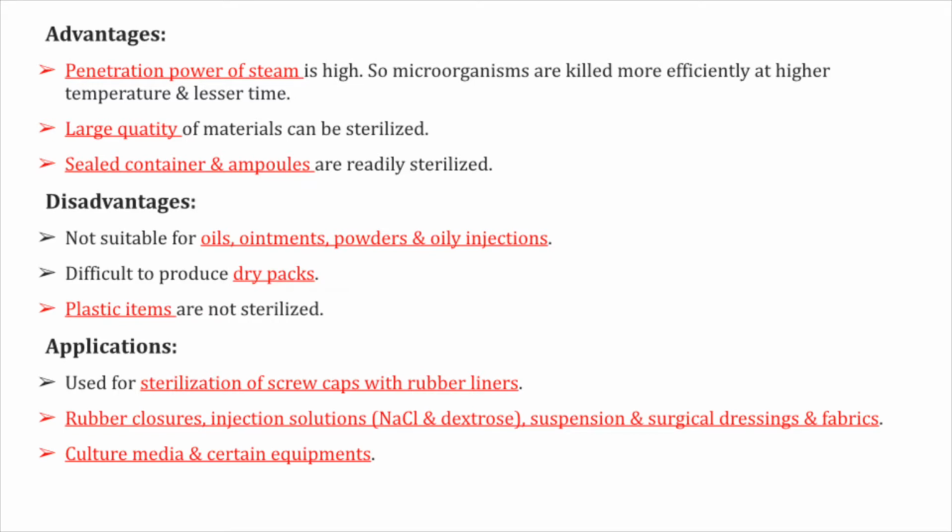with rubber liners, rubber closures, injection solutions like NaCl and dextrose, suspensions, and surgical dressings and fabrics can be sterilized, and also culture media and certain equipments can be sterilized using steam under pressure.